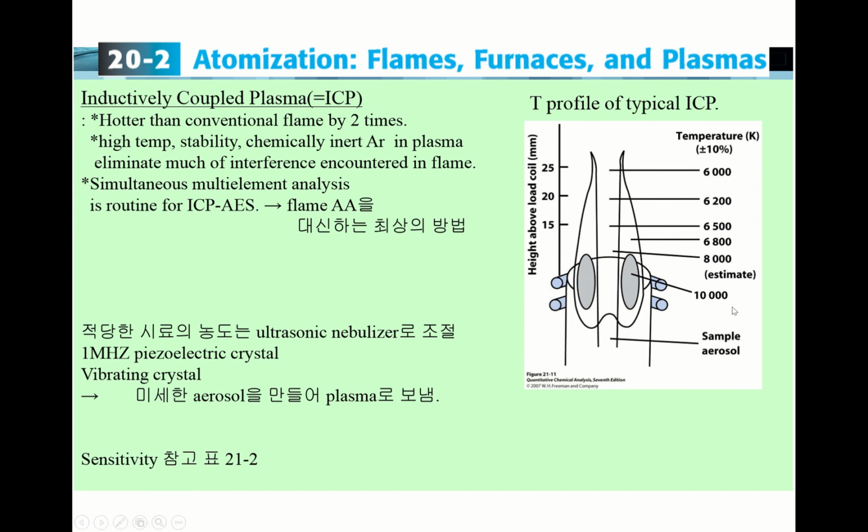The concentration of analyte needed for an adequate signal is reduced by an order of magnitude with an ultrasonic nebulizer.